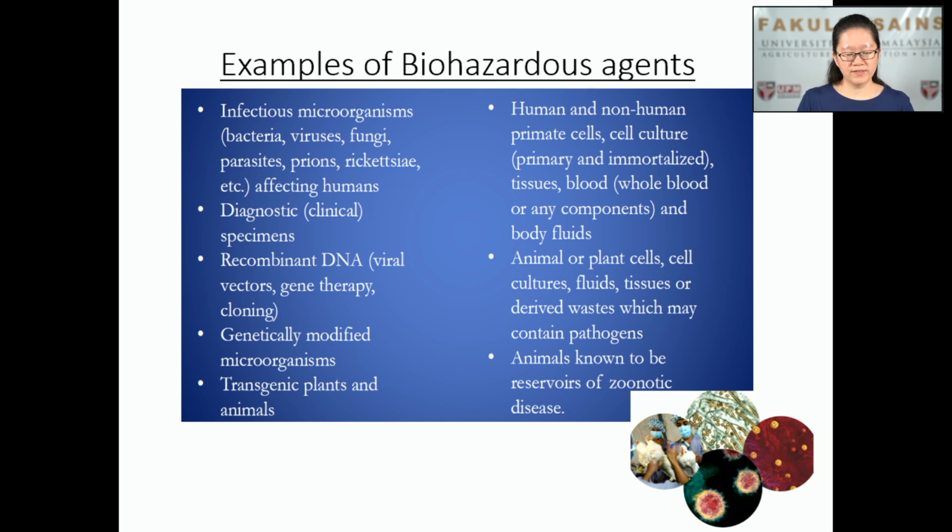So these are some of the examples of biohazard agents that may be present in the lab. When we come back later on, we'll talk about what the biosafety procedures or practices are that can be used to handle these different biohazards.